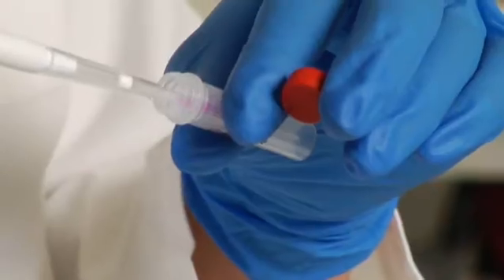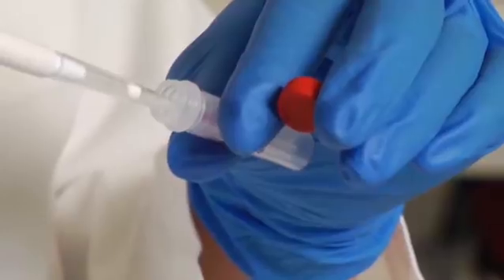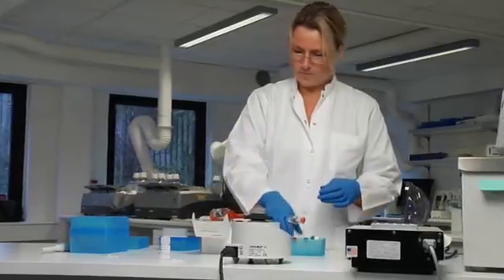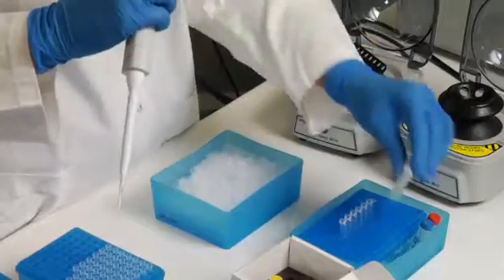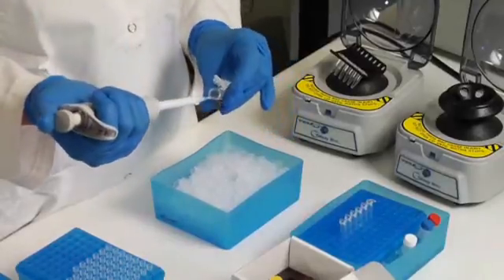Dissolve the dyes and the spike-ins in nuclease-free water by pipetting up and down at least 10 times, then place the tubes on ice. Make sure that the fluorescent dyes are protected from light. Next, prepare a master mix for the dephosphorylation step, which is the first step of the labeling reaction.